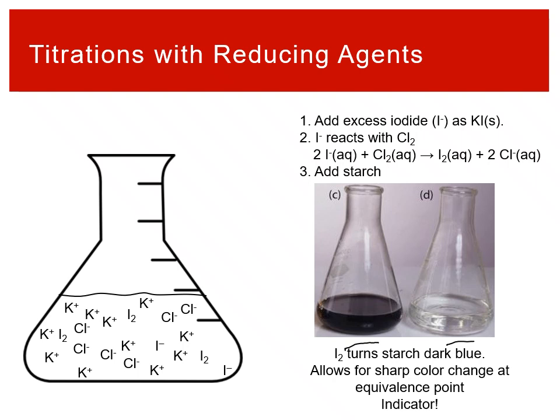You are still seeing a disappearance of color, but it's not gradual like it is for normal iodine, where it slowly fades from brown to red to yellow. Instead, it's dark blue to colorless. And so it's much easier to see immediately.